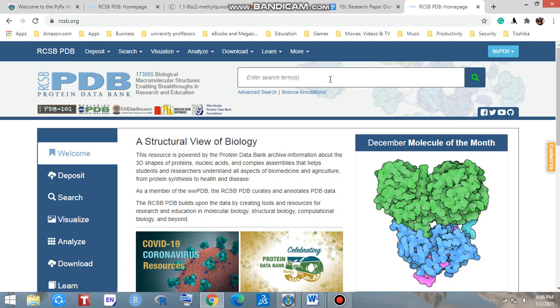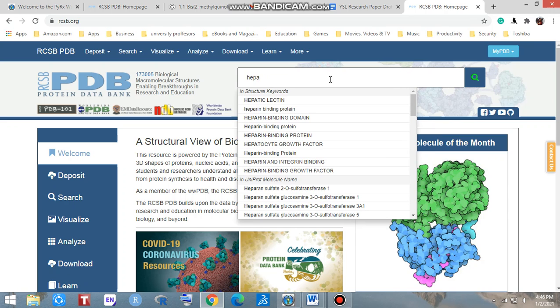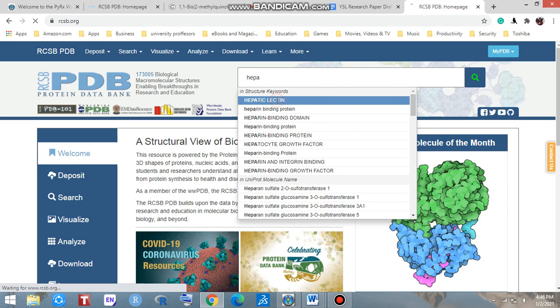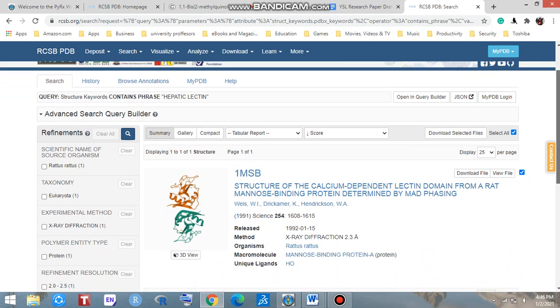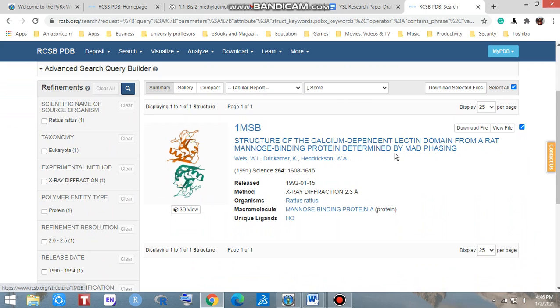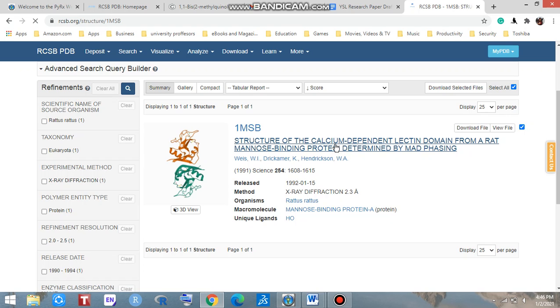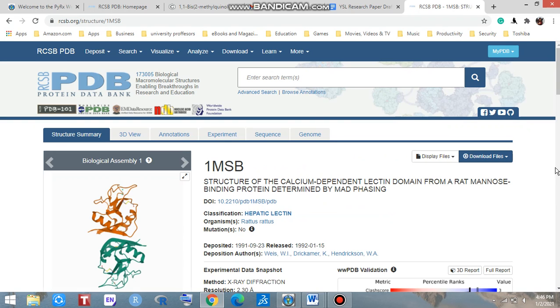Firstly, go to the search bar and you can search for whatever protein you need. If we search through the name of the protein — look, I am searching for hepatic lectin. Yes, look at that — that is a calcium-dependent lectin domain. Click here.